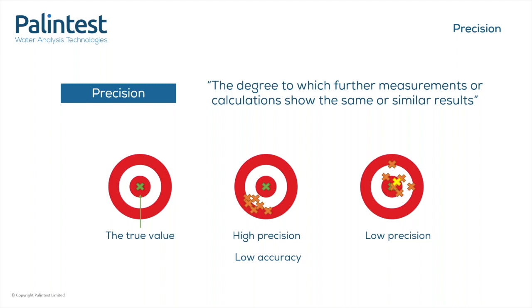So if you're testing something where the actions are quite serious, this could be a water supply being shut off, a factory closed, a set of products being scrapped, then this degree of accuracy may not be enough for your process. But if you were testing alkalinity of your pool and checking it remains within between 80 to 200 milligrams per litre, then this accuracy might be enough. So I've jumped on the fence and called it okay accuracy, all depending on where you're testing and what you're testing.